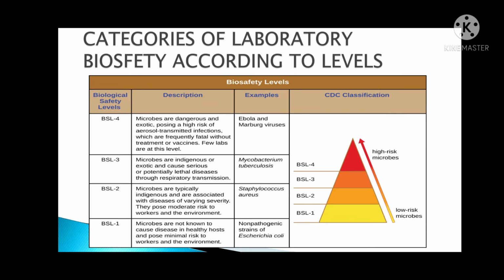BSL2 is appropriate when work is done with human blood, body fluids, tissues, or primary human cell lines where there is uncertain presence of infectious agents. Hand washing sinks and waste decontamination facilities must be available, and access to the laboratory must be restricted when work is being conducted. All procedures where infectious aerosols or splashes may be created are conducted in biosafety cabinets or other physical containment equipment.